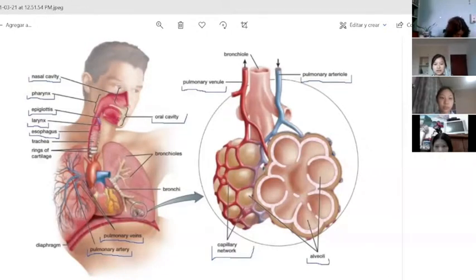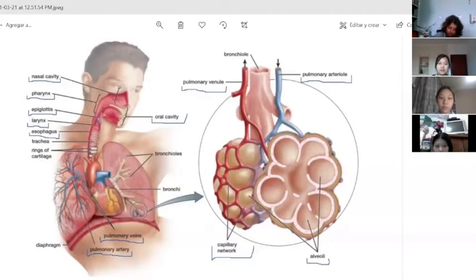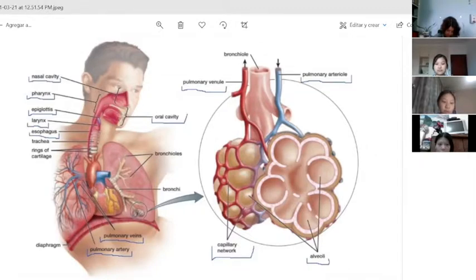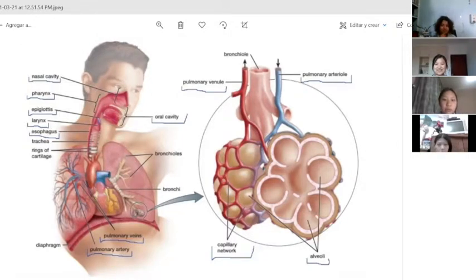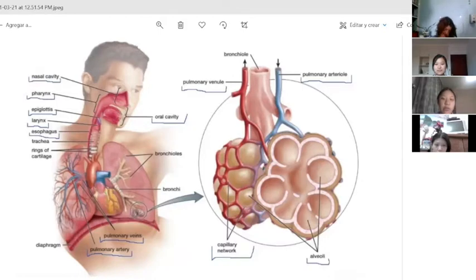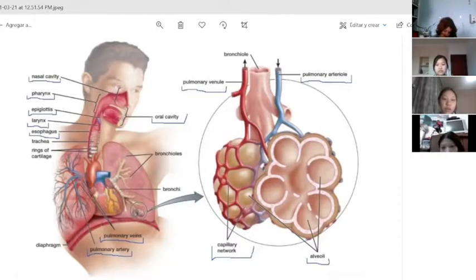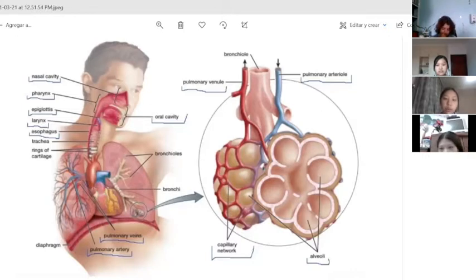The epiglottis is a leaf-shaped flap of cartilage located behind the tongue at the top of the larynx, or voice box. Its main function is to seal off the windpipe during eating so that food is not accidentally ingested. The esophagus is a hollow muscular tube that transports saliva, liquids, and food from the mouth to the stomach. The oral cavity represents the first part of the digestive tube; its primary function is to serve as the entrance of the alimentary tract and to initiate the digestive process by salivation and propulsion of the alimentary bolus into the pharynx. Each alveolus is cup-shaped with very thin walls and is surrounded by networks of blood vessels called capillaries, which also have thin walls.